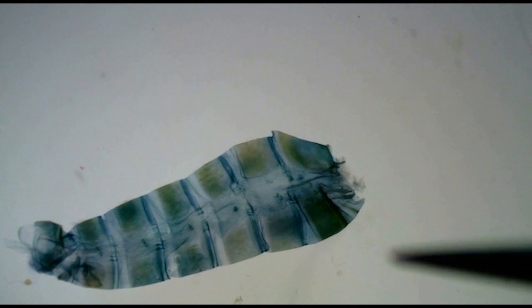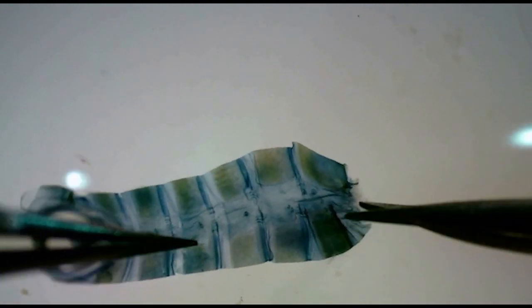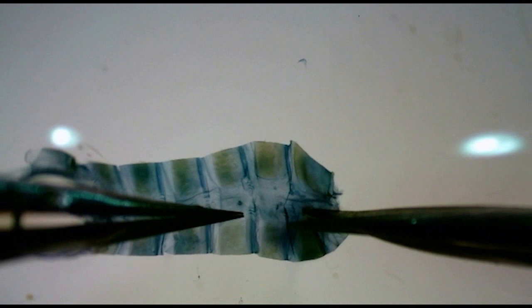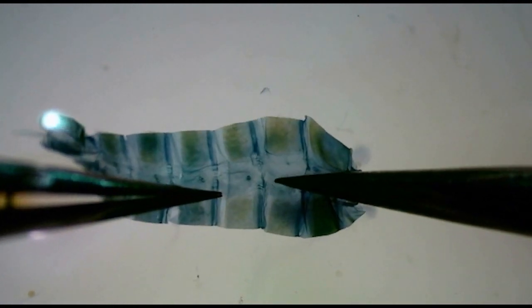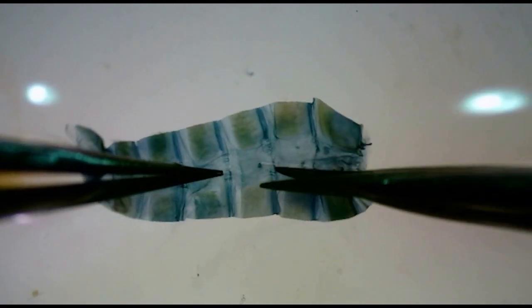Another optional step is cutting the abdomen to make a pelt. Using a fine pair of Vanna scissors, I cut lengthwise between the sternites and tergites to open up the abdomen.